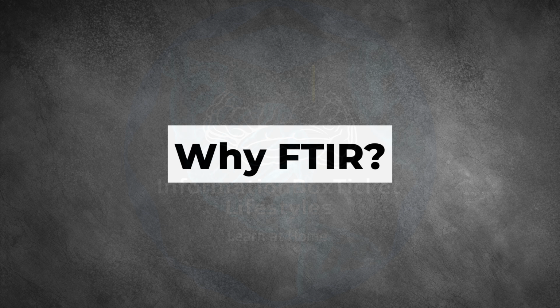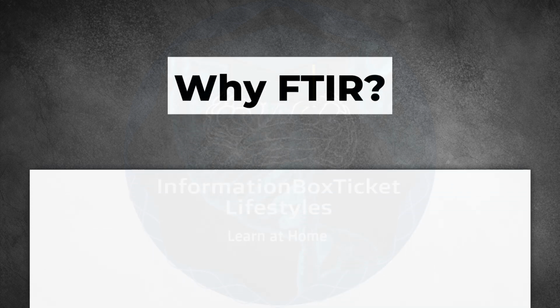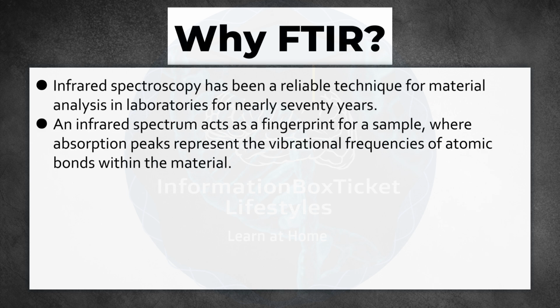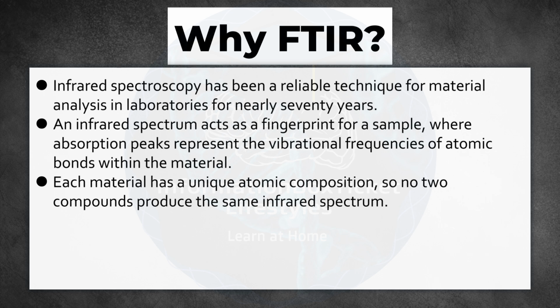Why FTIR? Infrared spectroscopy has been a reliable technique for material analysis in laboratories for nearly 70 years. An infrared spectrum acts as a fingerprint for a sample, where absorption peaks represent the vibrational frequencies of atomic bonds within the material. Each material has a unique atomic composition, so no two compounds produce the same infrared spectrum.